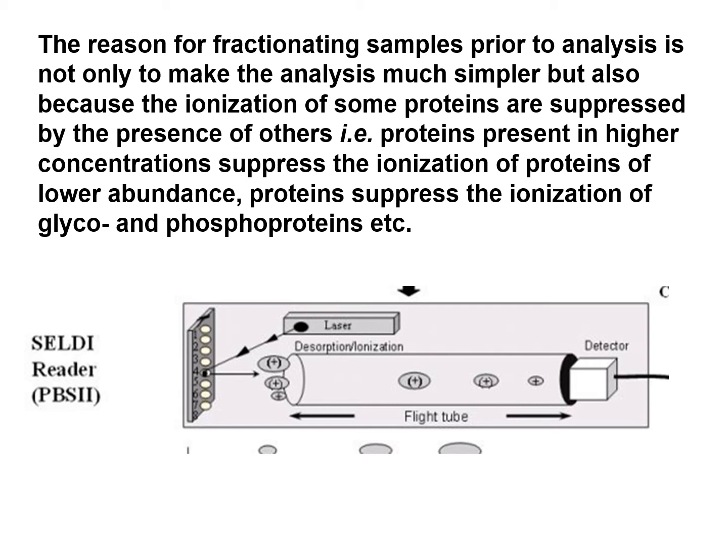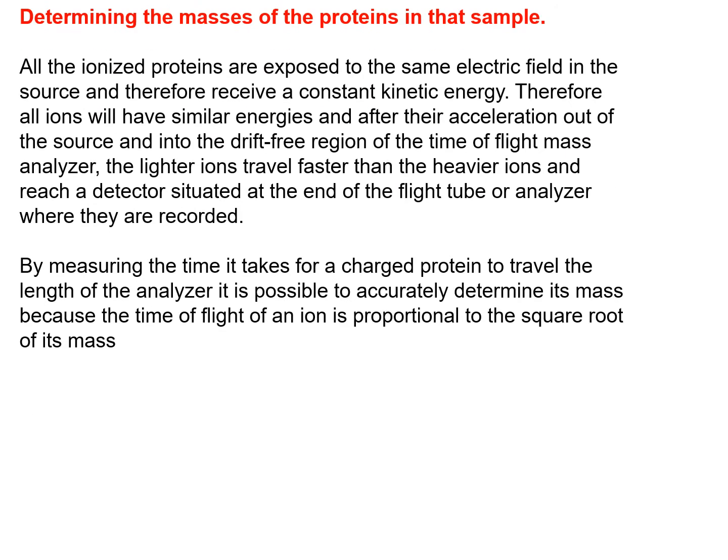And so it's talking about low abundance proteins. Modified proteins might be hidden or underestimated. So, we're talking a biomarker, but you're missing how abundant the biomarker is, or it's hidden and you missed it. So that's part of the multi-spot purpose here. And of course, there's the ionization there.